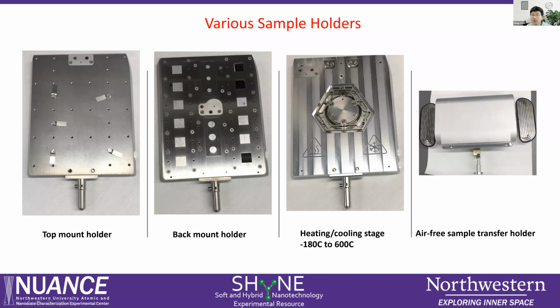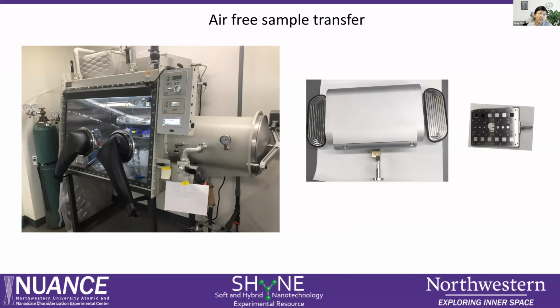And this, we have a air-free transfer. So we can use a glove box for some battery sample. We can mount the sample inside here. And then put the sample holder in this small box, and then use a small transfer can get out. And this box we can load in the load lock. And inside, after pump down, we can open inside. So that is the totally air-free, and you can transfer.